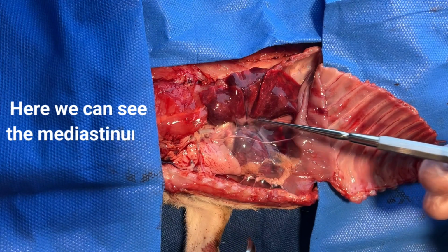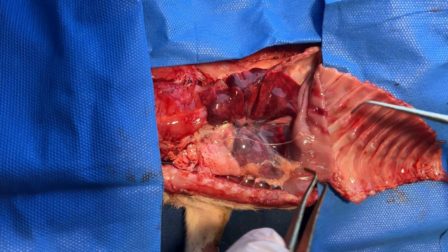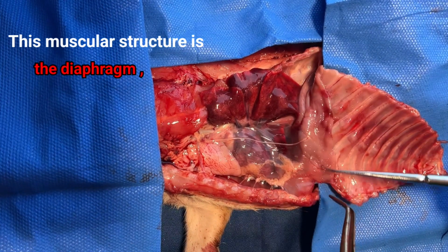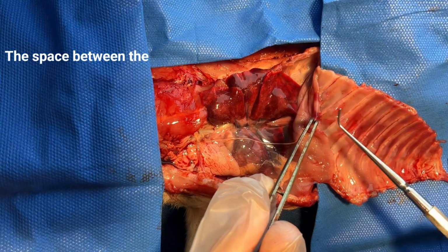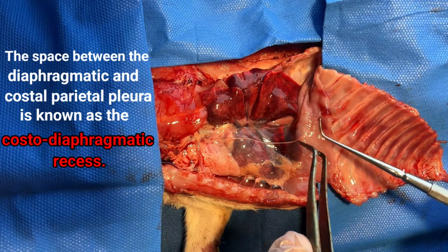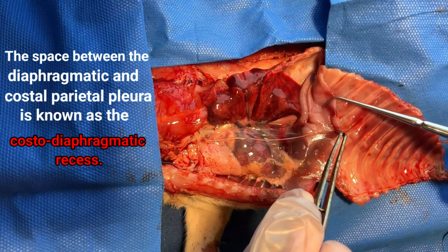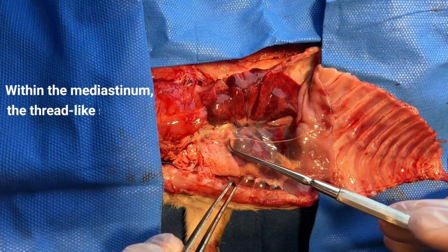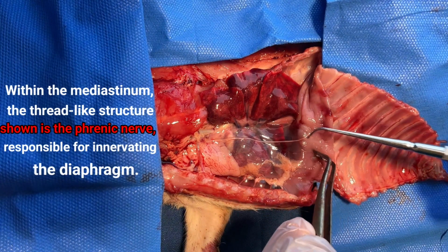Here we can see the mediastinum, which is covered by the mediastinal parietal pleura. This muscular structure is the diaphragm, which is covered by the diaphragmatic parietal pleura. This space between the diaphragmatic and costal parietal pleura is known as the costodiaphragmatic recess. Here, within the mediastinum, the thread-like structure shown is the phrenic nerve responsible for innervating the diaphragm.